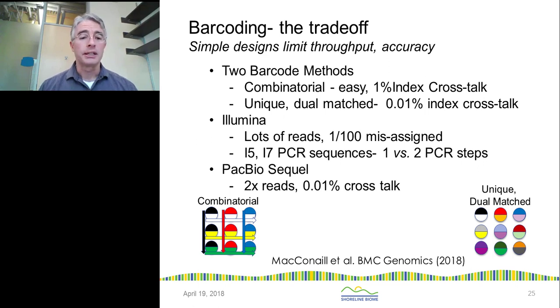You're using, across each column and row, a single barcode. So if you look down the first column, you can see that the top half of the circle is black. And if you look at the top row, you can see the bottom half of each of the circles is white. And it's the combination of the two that tells you which sample the read originally came from. So those are attached during sample prep, and then they're mixed together and sequenced together, and then you read the sequence to sort them later.